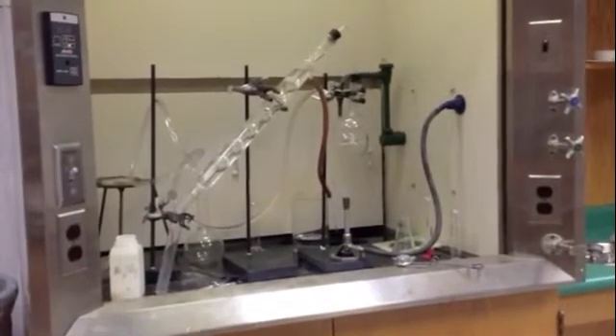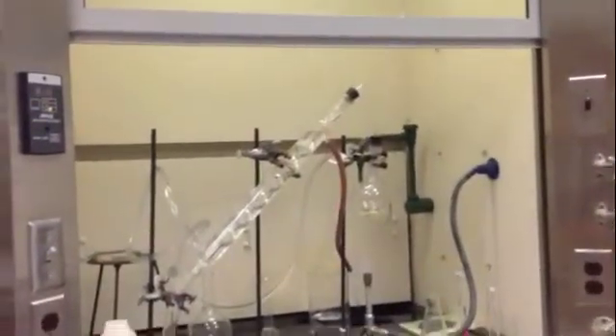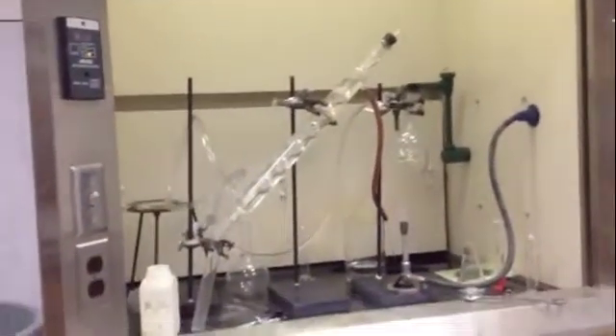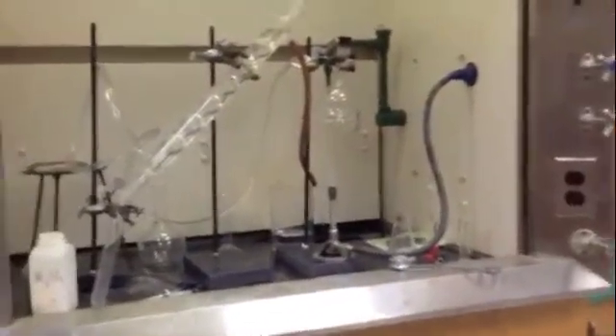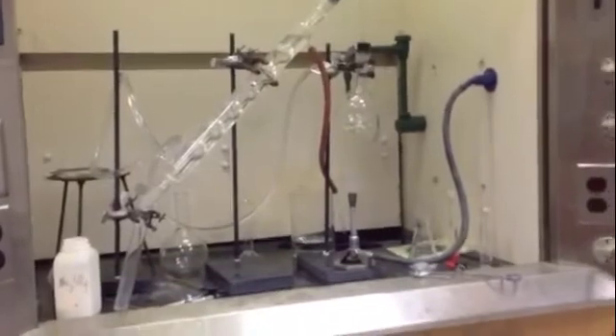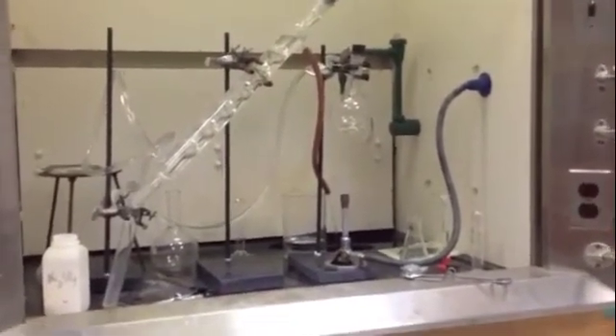My last step is just to distill. You can see I've got a Bunsen burner heating the liquid here. That steam will pass up through the neck and into the condenser, and I'll collect the distillate down below in a test tube. I'll monitor the temperature and keep that constant and give a constant flow of water on the condenser. That's just about it - that's the last step.